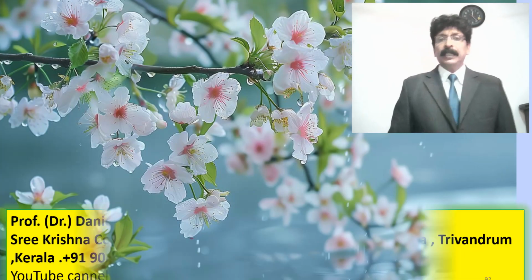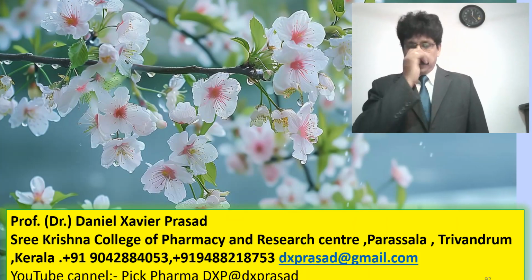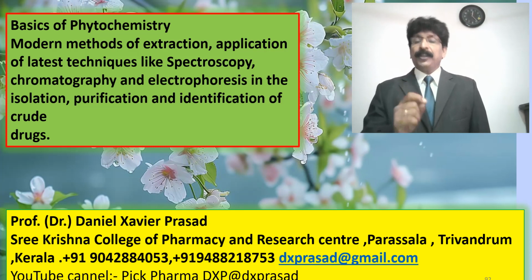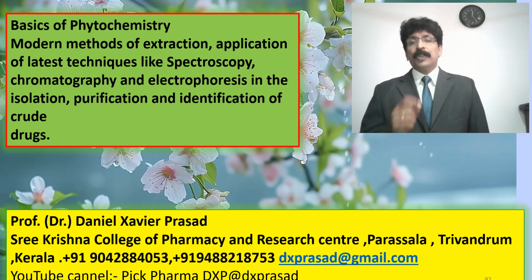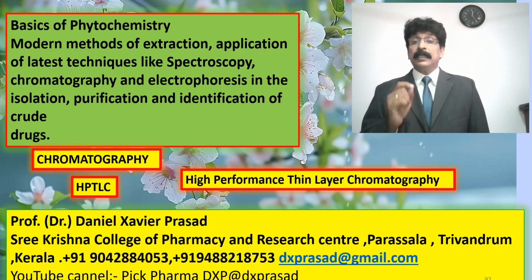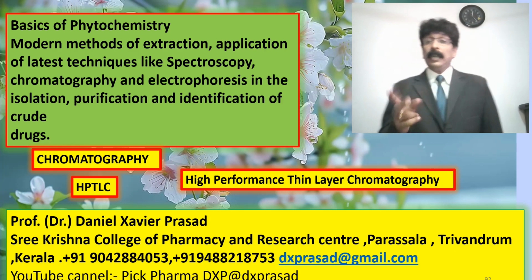Today we are going to have a discussion about an important technique in chromatography after HPLC. This is about HPTLC, especially in this topic and also in herbal standardization and herbal formulation, identification of phytoconstituents. This chromatography technique, HPTLC, high performance thin layer chromatography, is related to thin layer chromatography as well.